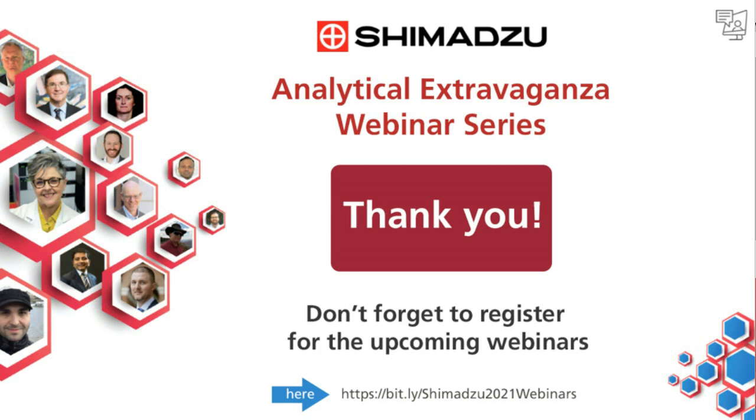You would probably do it online. I've seen in other labs they had an LC in front of the ICP mass spec, but for the questions that we need to answer for our clients, it's usually not in demand.